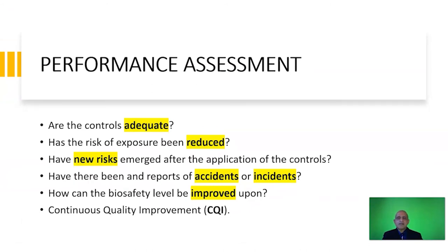The third step in the cycle is performance assessment, in which you ask these questions via audits. Are the controls adequate? Has the risk of exposure been reduced? Have new risks emerged after the application of the controls? Have there been reports of accidents or incidents? And how can the biosafety level be improved upon? I have highlighted these specific terms because I will introduce the definitions for these terms in the course of this MOOC.